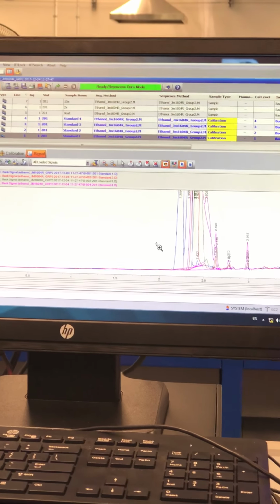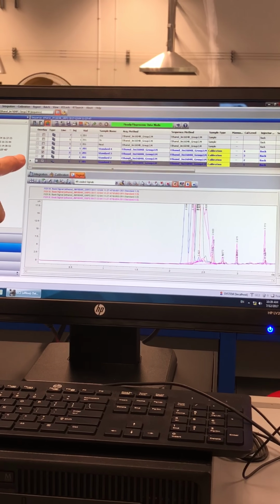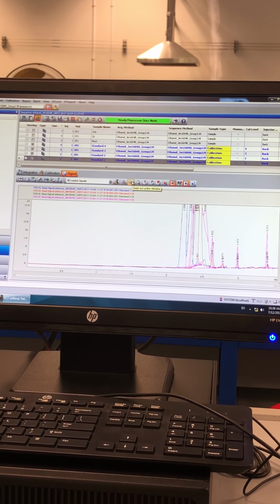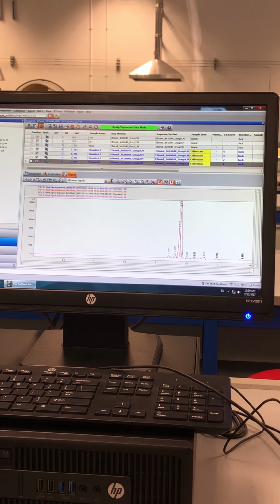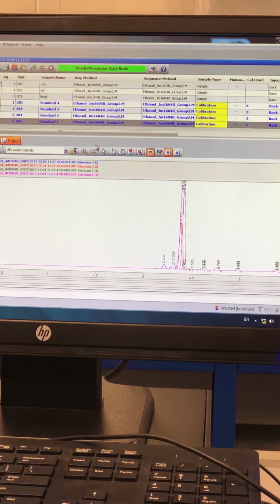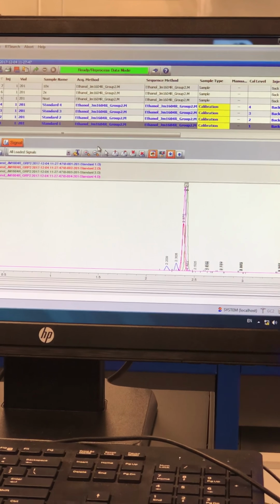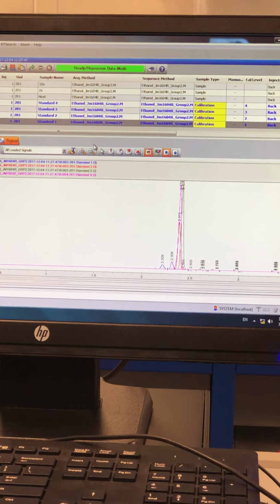Then minimize the image. Minimize the magnifying glass 9 minus. Then you will see there's actually an increment in the peak. Can you see that? There's actually differences in height and peak shape, right?